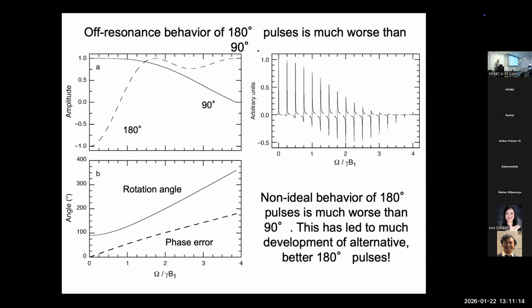Most of the time you're hoping to excite the full spectrum, but sometimes you're not. And that's the simplest way to get some selectivity, is to adjust the offset in the B1 field. So a 90-degree pulse looks like a 360-degree pulse at some off-resonance position. One of the problems will ask you to figure out exactly what the relationship is. And then the upper corner here just shows for the spectra what this looks like.